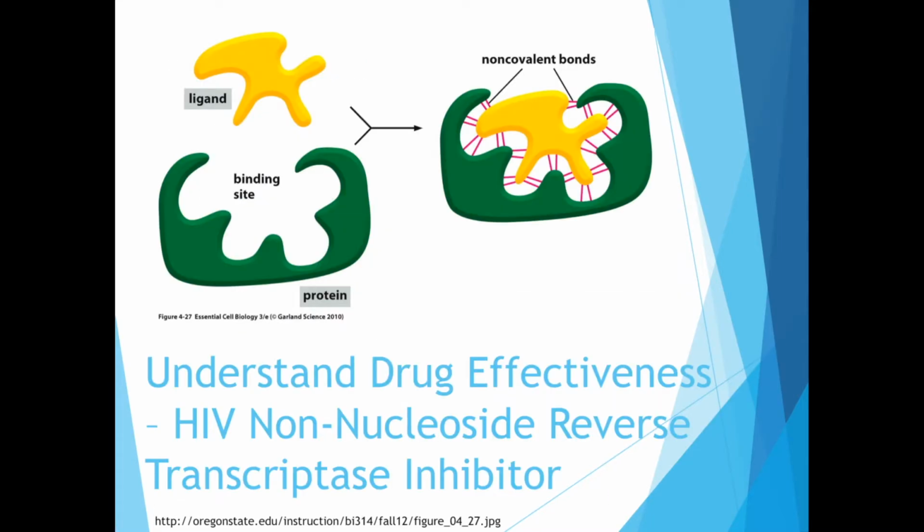NMR has also been applied to understand ligand binding. To better illustrate this application, we'll talk about analyzing the effectiveness of different drugs that attack human immunodeficiency virus, or HIV.